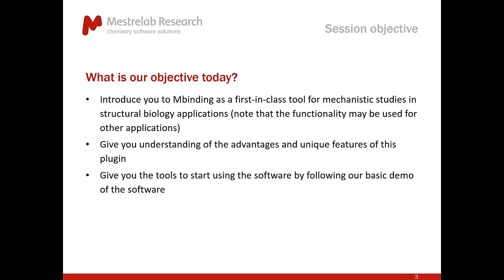Okay, we want to give you an understanding of the advantages and the unique features of the plugin and how it may help your workflow, particularly if you work in this kind of application, and to give you the tools today to start using the software by following the basic demo that Pablo will do after this initial presentation.